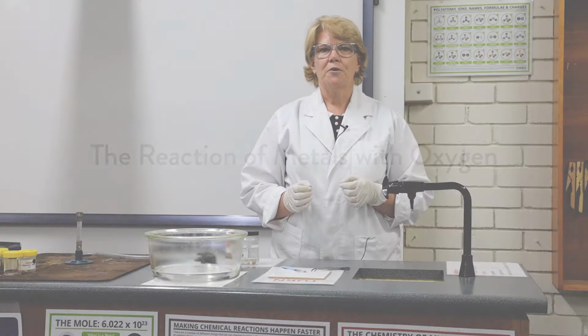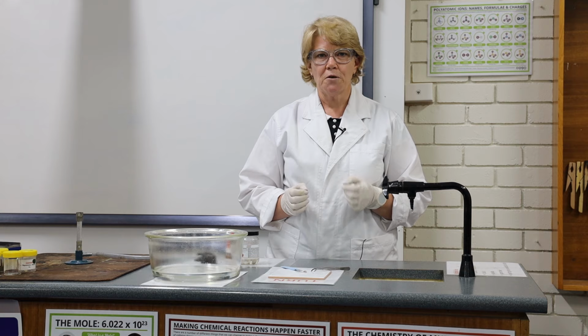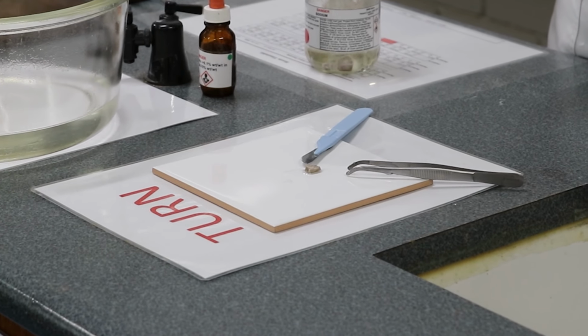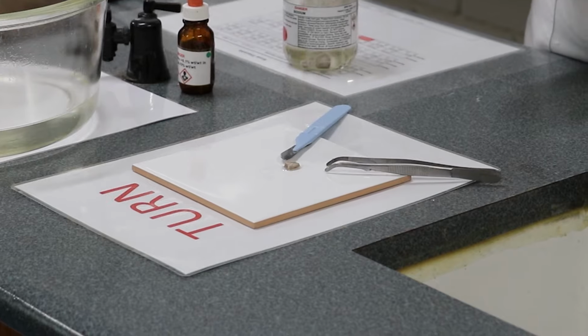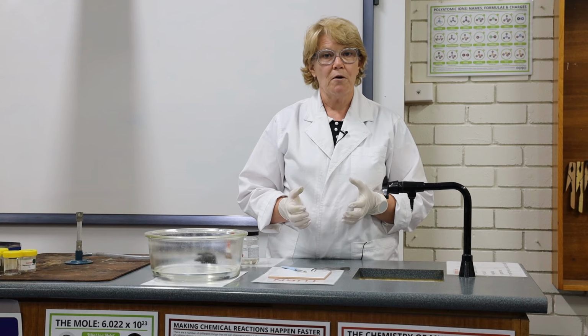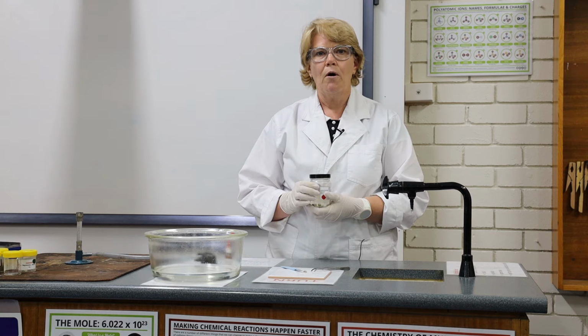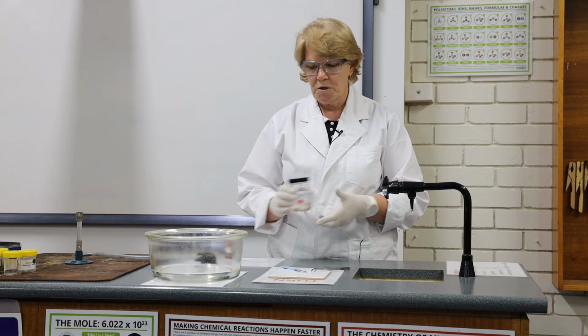Let's have a look at some sodium. We're going to look at the reaction of sodium with oxygen in the air. If we see our piece of sodium, we see it looks pretty much like a rock. This is because what we're seeing is a coating of sodium oxide, because sodium reacts with oxygen in the air. In fact, it's stored under oil to keep oxygen and water away from the sodium.